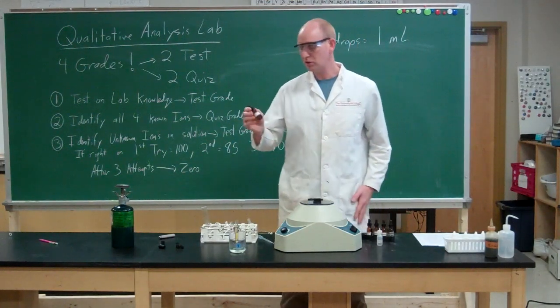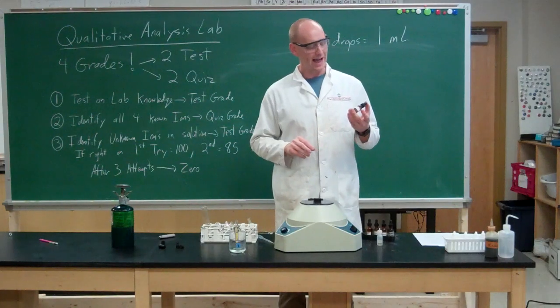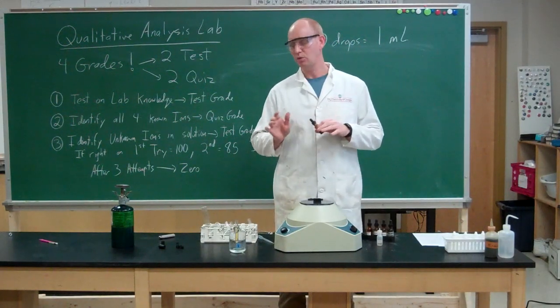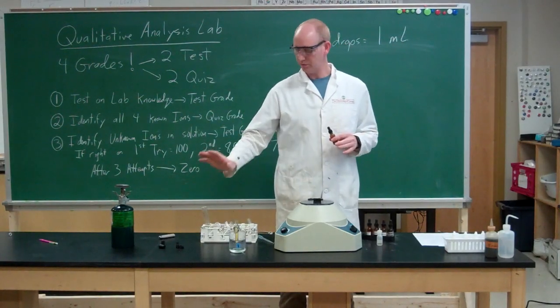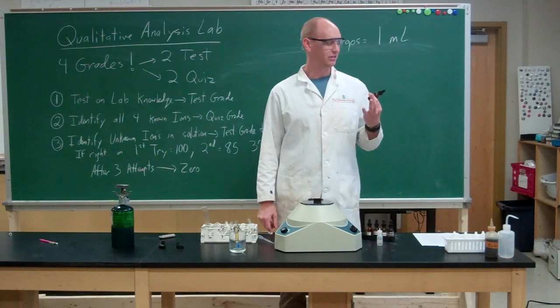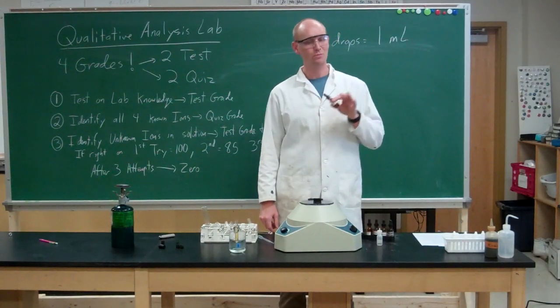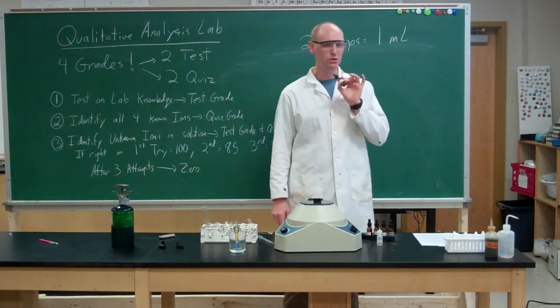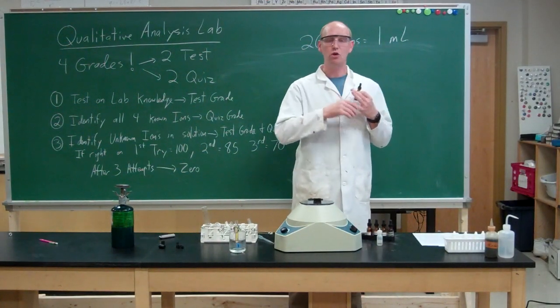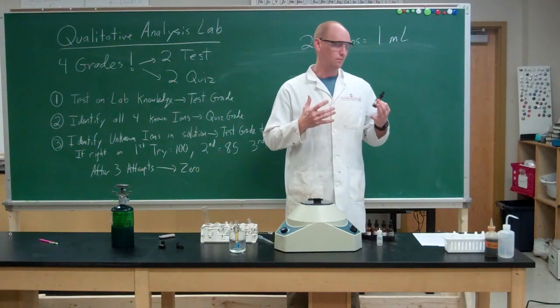Our barium chloride reacts to confirm the presence of chromium. If you remember me saying way back earlier when I was doing stuff with the big test tube, our sodium hypochlorite basically oxidizes chromium to a chromate ion. And barium chloride forms a pale yellow solid with chromate. It forms barium chromate, which is insoluble.